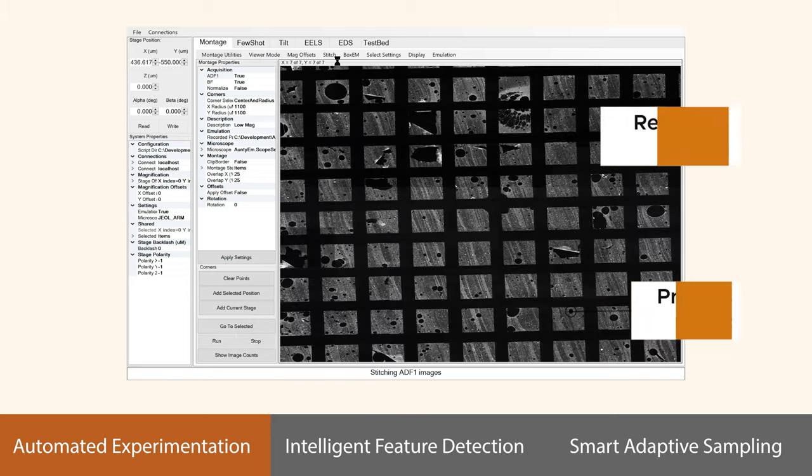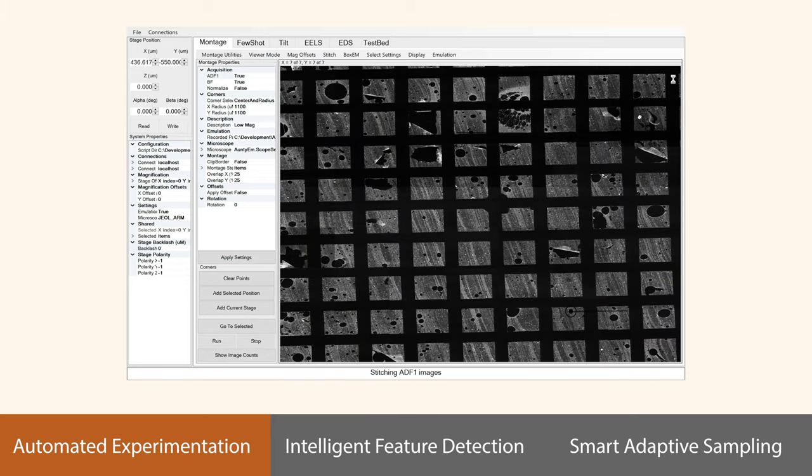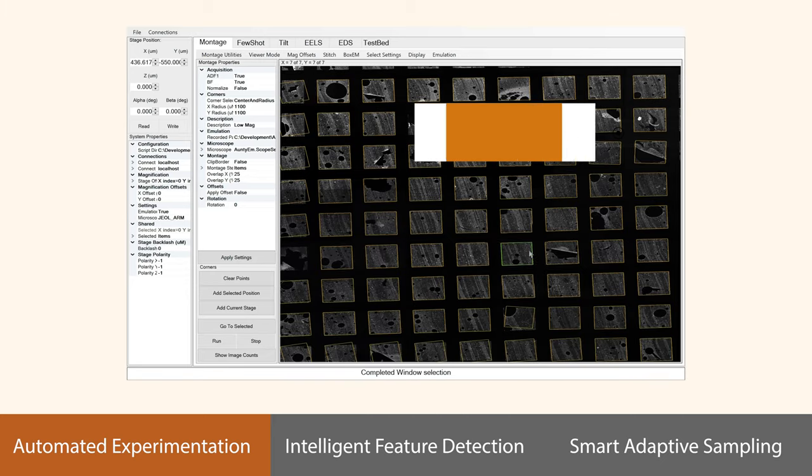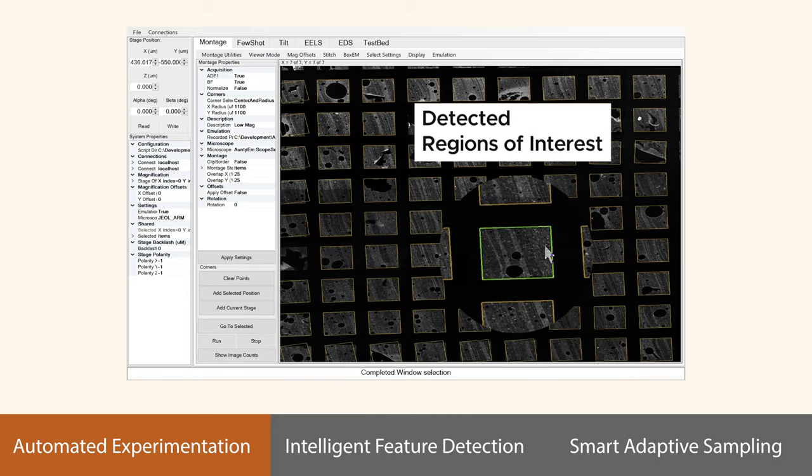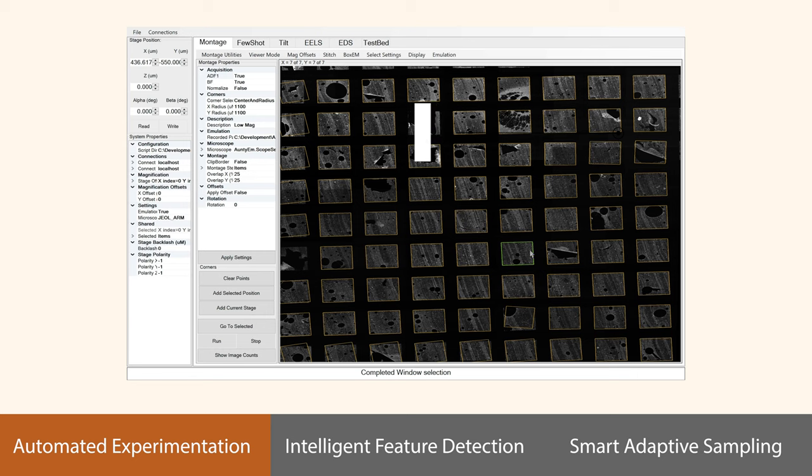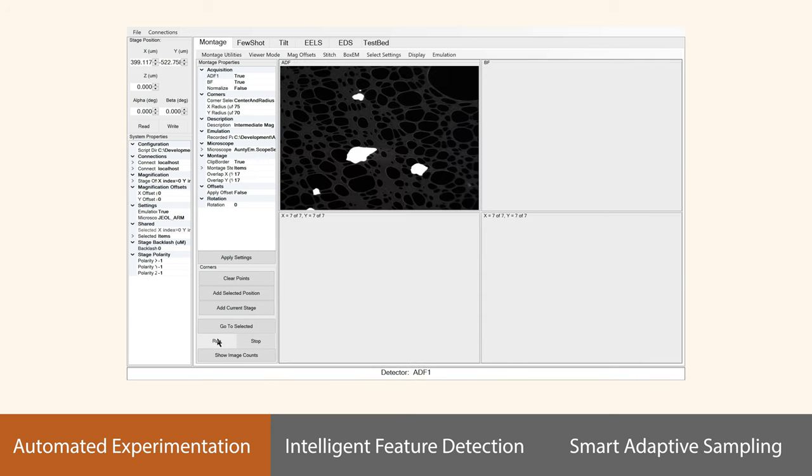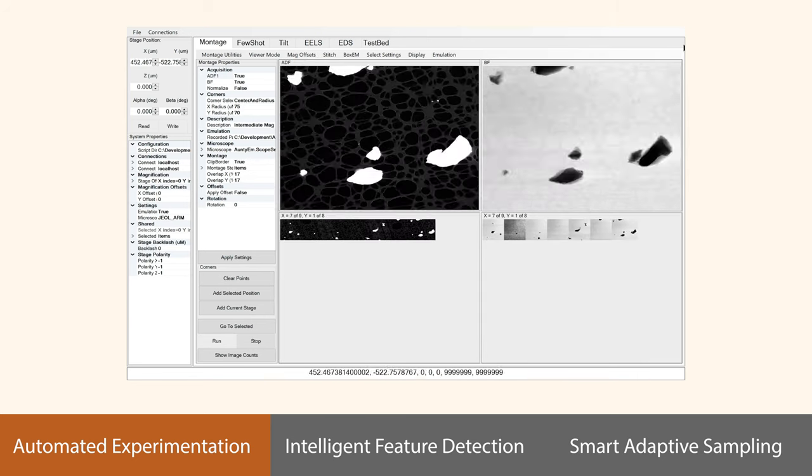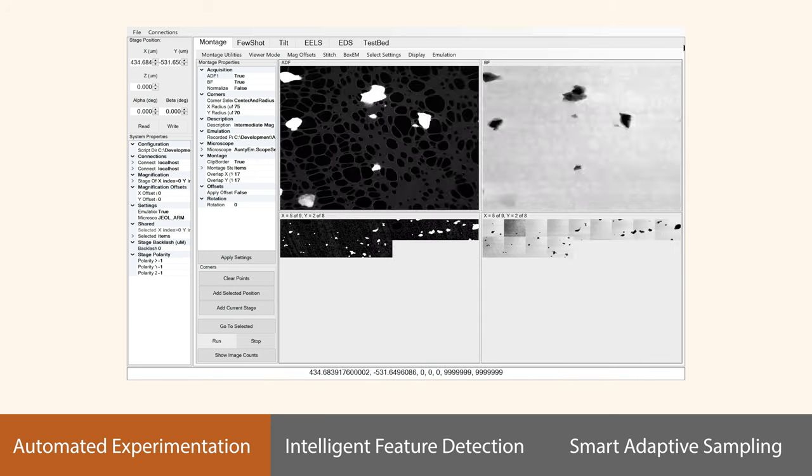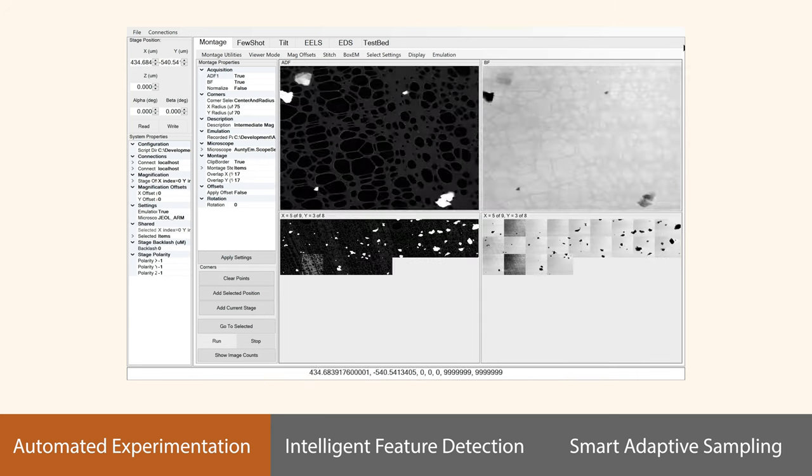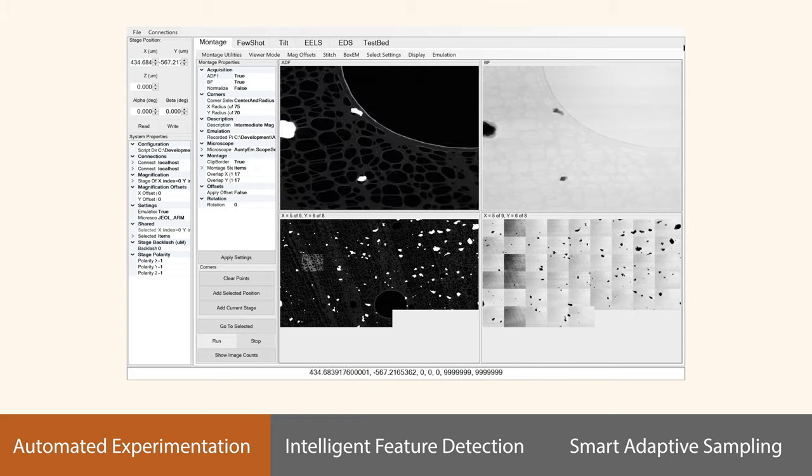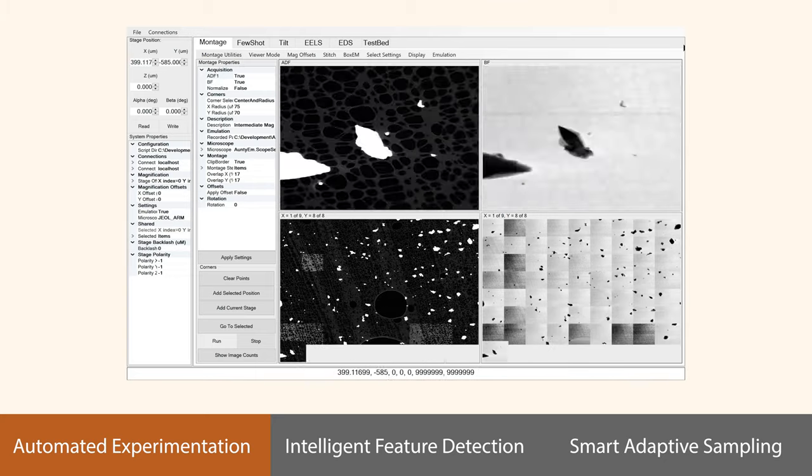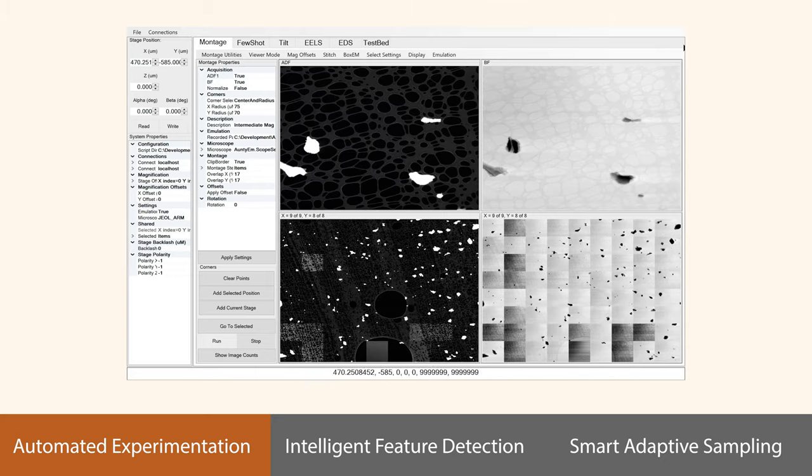AUTO-EM employs advanced computer vision algorithms to rapidly generate high-resolution images and seamlessly stitch them together, similar to how satellite data is displayed in Google Maps. This approach ensures comprehensive and statistical imaging coverage.